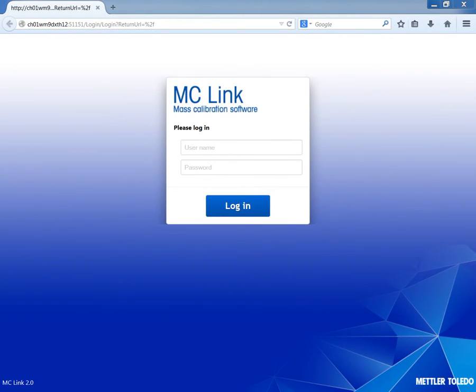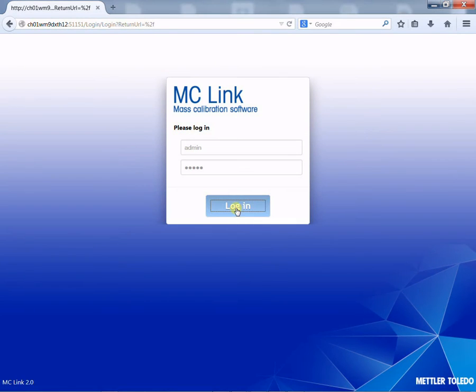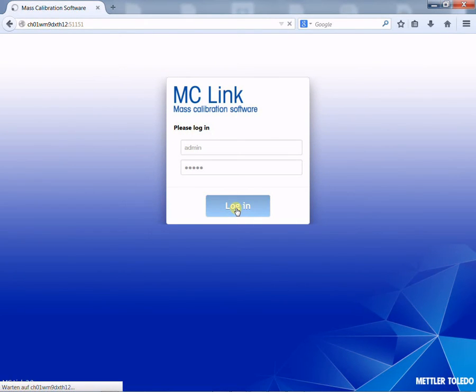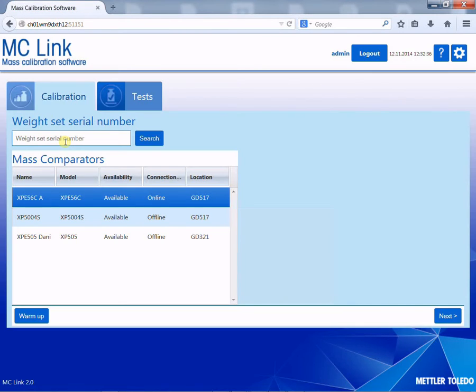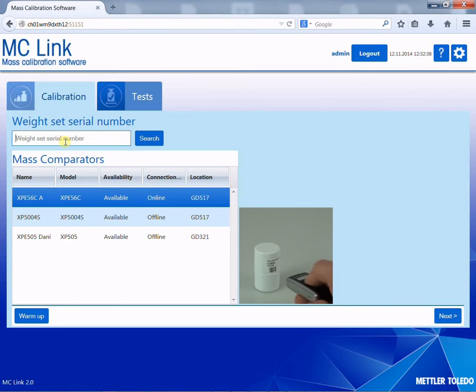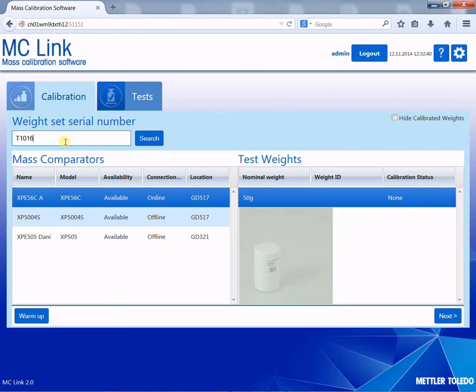With the data already defined in the office client, we move to the laboratory to perform the mass calibration. We open the browser on a tablet or laptop and enter the user name and password for full traceability. With multilingual communication, the user is guided in seven languages through the whole process. With the handy barcode reader, the weight set ID is read, and all the relevant data is retrieved from the office client database.